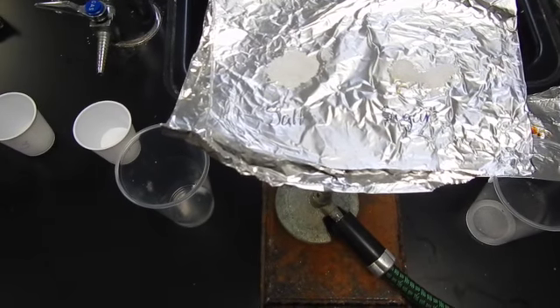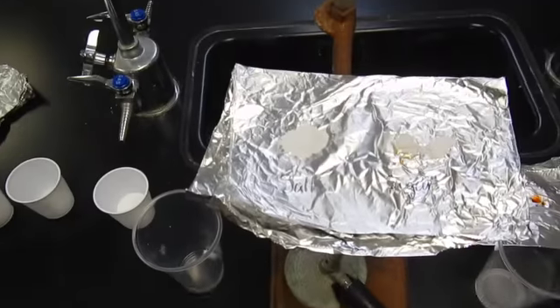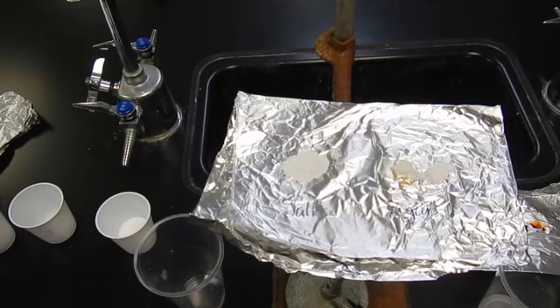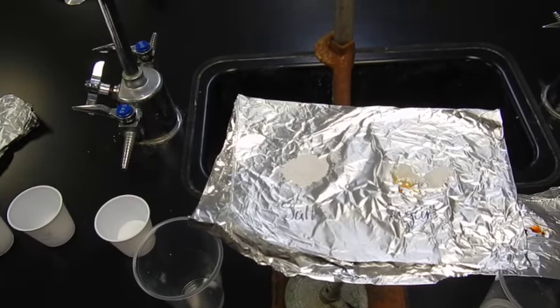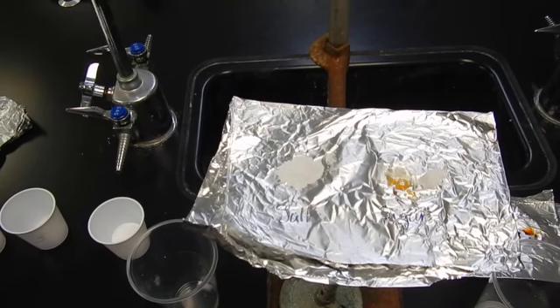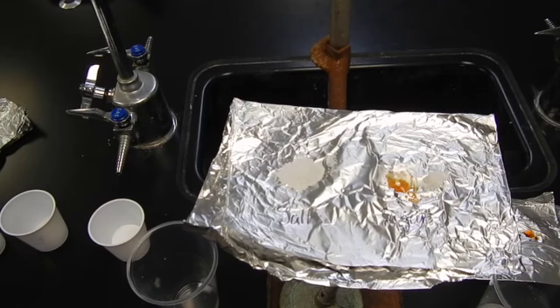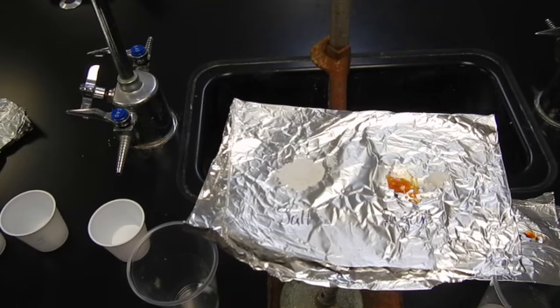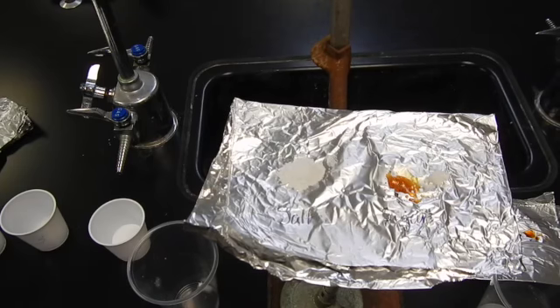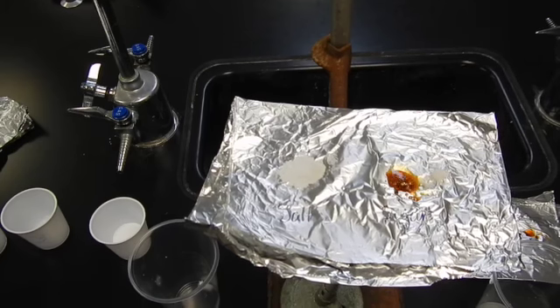So you can see the sugar is starting to smoke and melt and turn yellow, whereas the salt has not really changed much. So in the chart you can say that sugar has a relatively low melting point because it has not even been a full minute and it is already boiling, and then salt still looks exactly the same. There's no color change. It's still in its particle size. So for that, you can put a relatively high melting point.